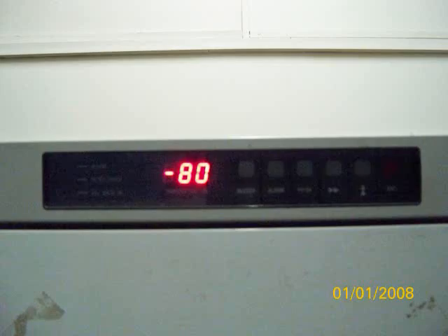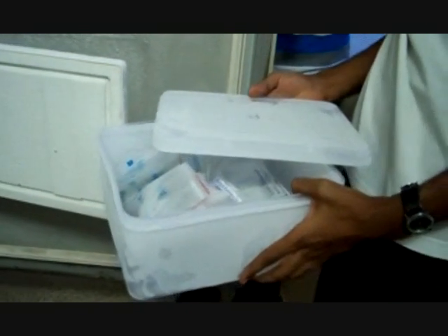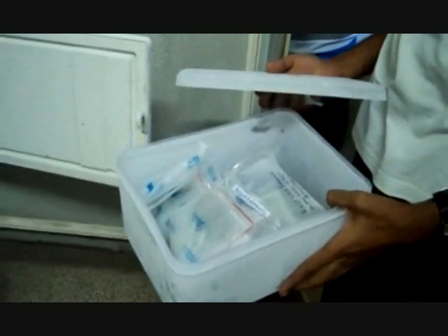The samples stored at minus 80 degrees Celsius are for long-term storage. This is ideal for preservation of biological samples, including cDNA, competent cells, leaf samples, stem cells, blood samples, vaccines, clinical samples, and RNA.